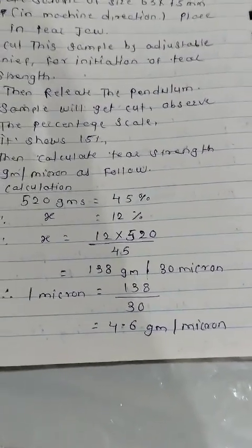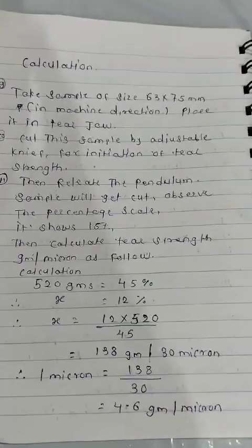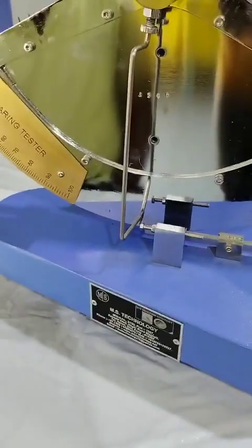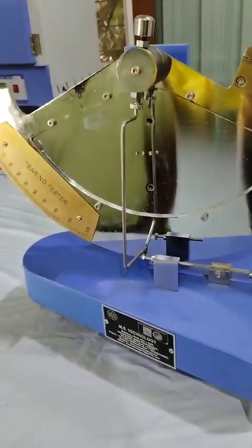As per this standard, our requirement is 2 grams per micron minimum. So this is how we can calculate the tear strength of the film. Thank you.